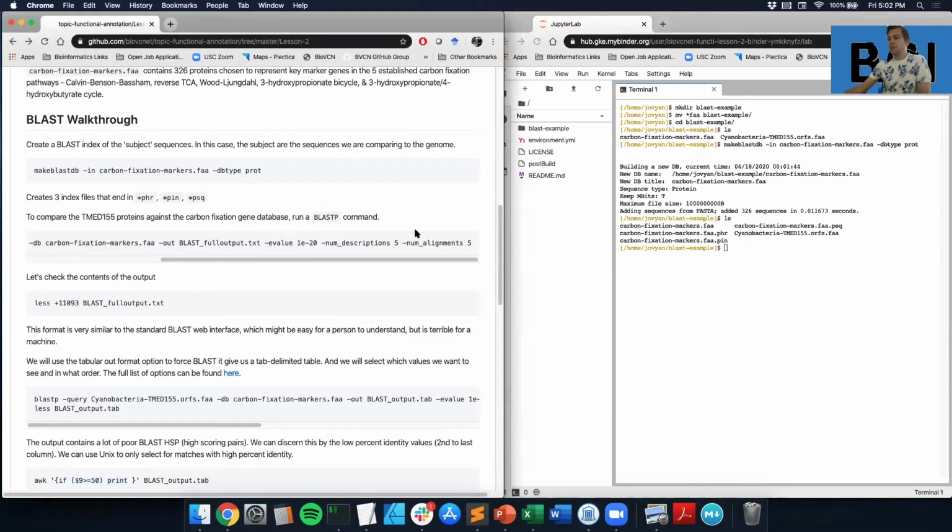And then we have some things that we can set ourselves. So here, we're setting an E value. The default number that BLAST wants to set here itself is 10, which is incredibly high and will give you lots and lots of false positives, as BLAST will basically give you any type of small word match that it can find amongst your query and database that you're running against.